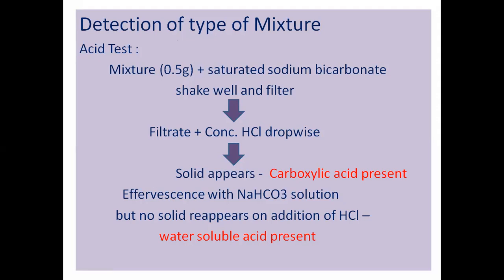In that you will take a fresh 0.5 gram of mixture in a test tube. Then you will add the saturated sodium bicarbonate to it. You will shake it well and then filter it. Now, saturated sodium bicarbonate means what? If you take 100 ml of water and add sodium bicarbonate in it, you have to add and stir until the sodium bicarbonate dissolves, and the point comes when the sodium bicarbonate does not dissolve and remains as it is. That means it becomes saturated.